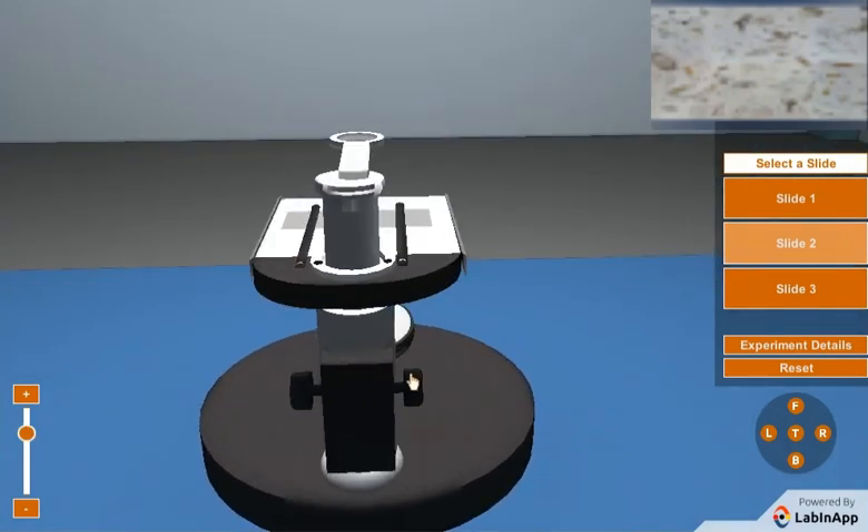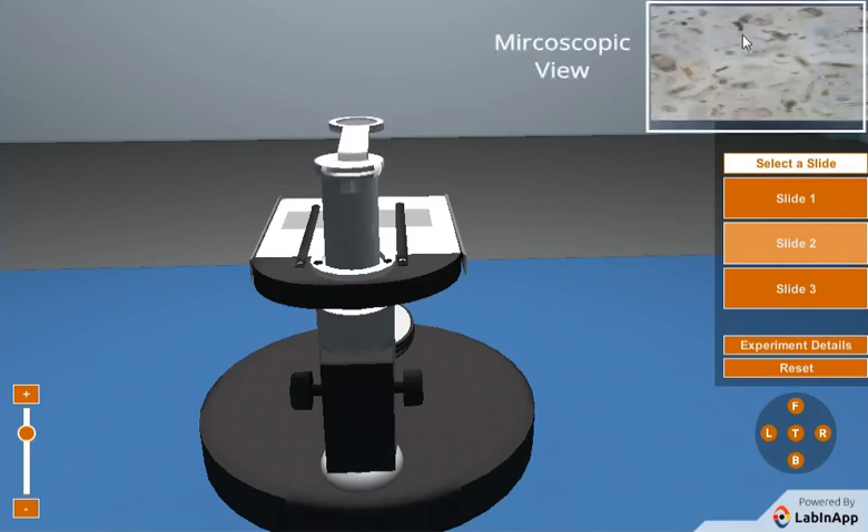Now click on the adjustment knob and rotate to adjust the focus. You can see the microscopic view on the panel.